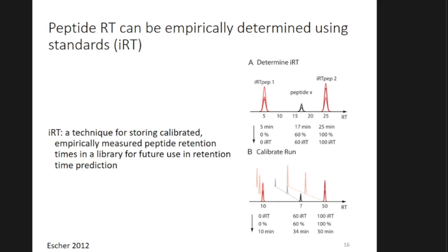Absolutely. Obviously, some peptides will fall within certain peaks of the PRTC and some won't. You just pick sets. You can use all of the standard peptides included, the 15 peptides in the PRTC mix. PRTC stands for Pierce Retention Time Calibration peptides, so we just call it PRTC.